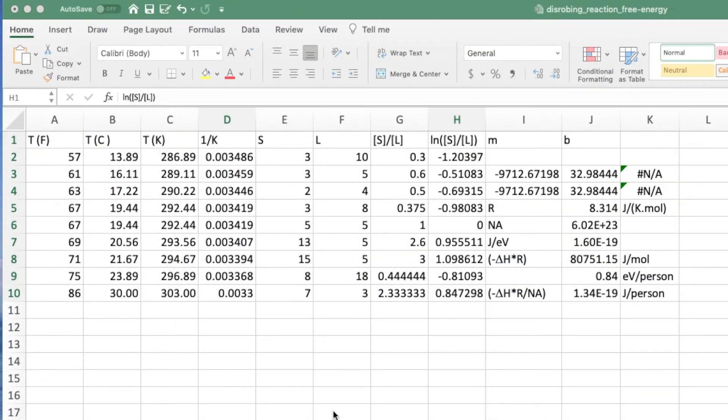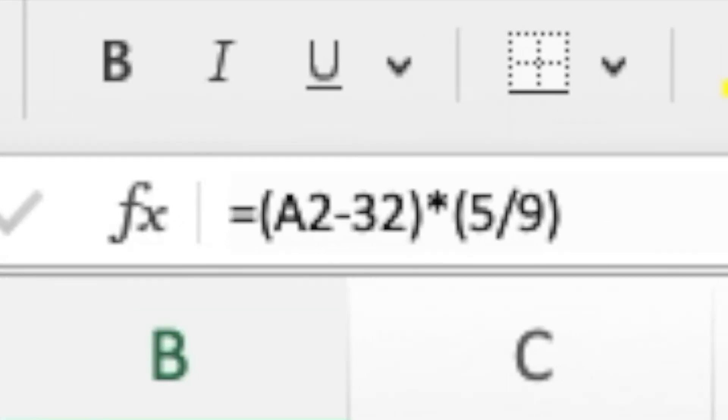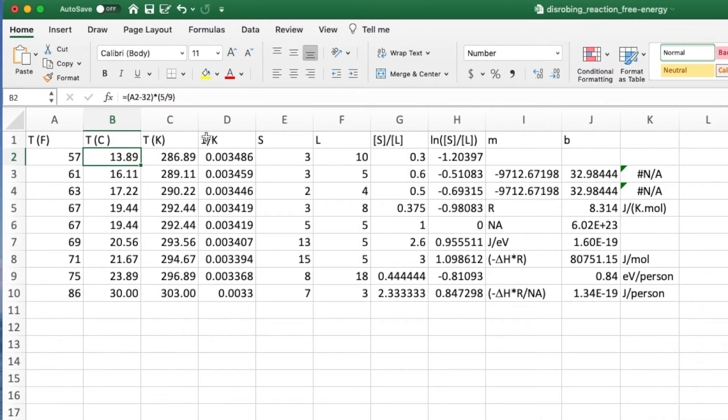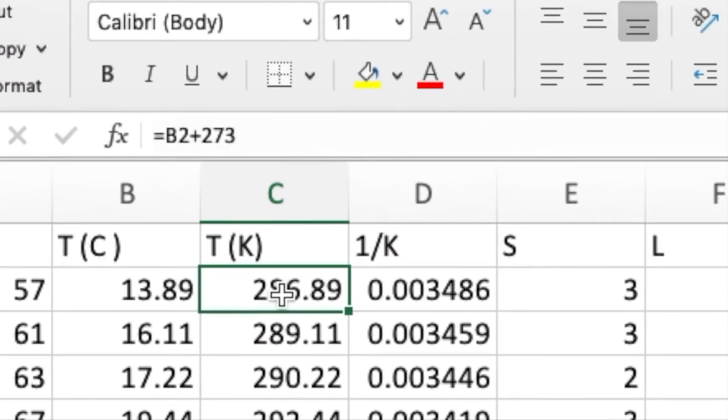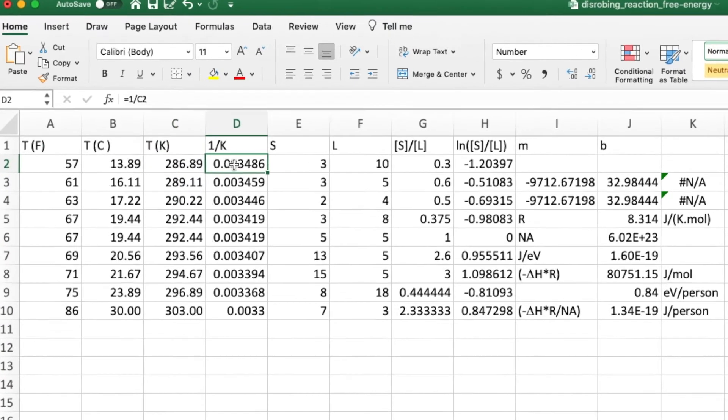If you didn't take data directly into a spreadsheet, you'll want to enter it into one now. Start by entering each temperature for which you have data into a column. I've done that in column A here. This data is in degrees Fahrenheit. Next, I created a column to convert the temperature into degrees C. I've done that in column B. If I click cell B2, you can see the conversion formula. Next, I used column C to convert the data to degrees K. Clicking on cell C2 shows the conversion. Column D computes one over temperature. Clicking on cell D2 shows the conversion.